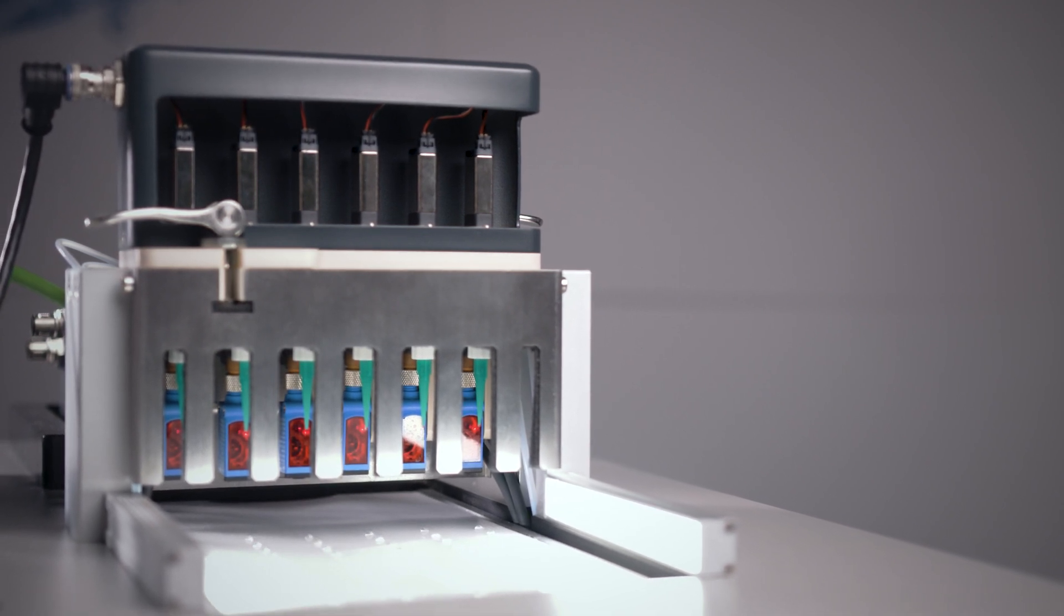Have we sparked your interest? We are happy to optimize your dosing process.